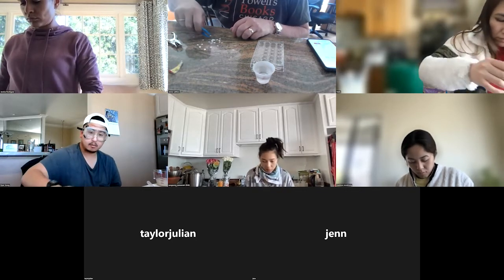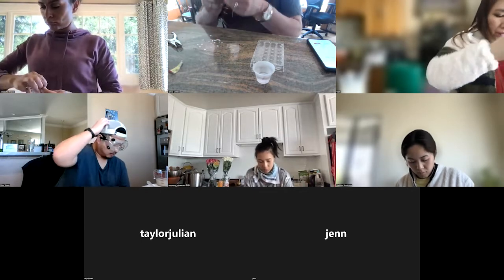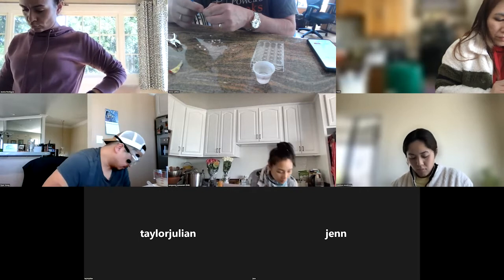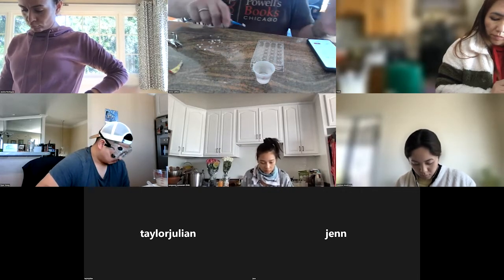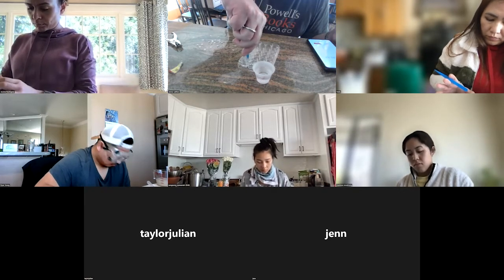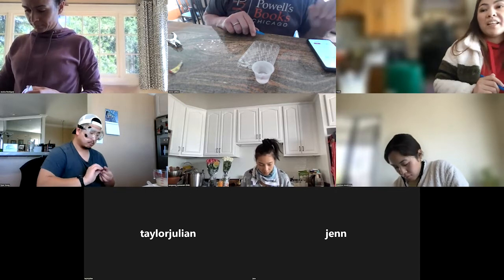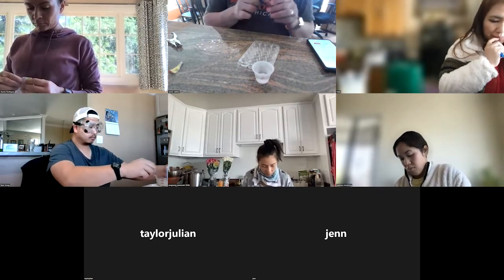I'm going to try the 25, see if I get anything. You don't really see a lot of bubble formation with the 25. Well, but the 50, you're starting to see it, are you, Ryan?